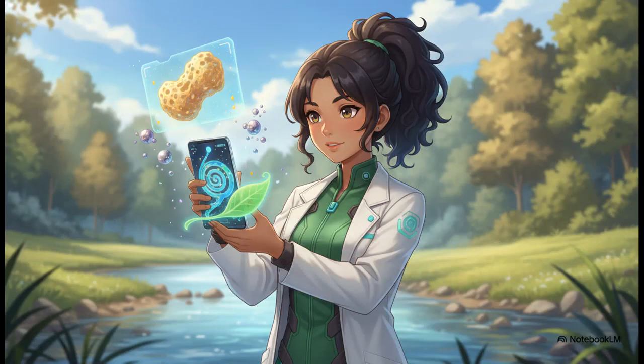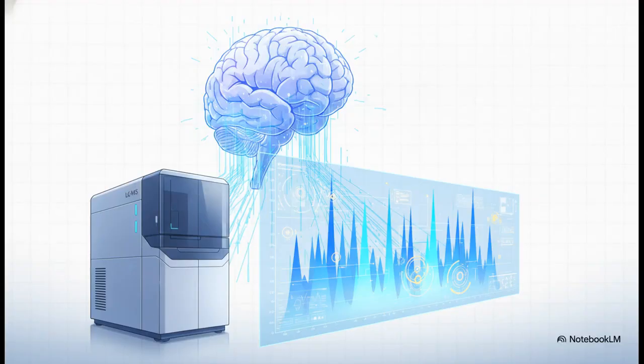And the best part? The field is constantly evolving. Today, we're pushing the boundaries of what these systems can actually do. We are actively developing these incredible, compact, portable microfluidic devices that let scientists conduct highly sensitive on-site analyses, which drastically reduces sample consumption. Even the stationary phases themselves are getting major technological upgrades, with things like monolith columns and nanoparticle materials. We're even seeing a big shift toward using natural solvents to make these vital chemical analyses much more environmentally sustainable. Let's move forward and see how this builds directly into the future with the integration of artificial intelligence.